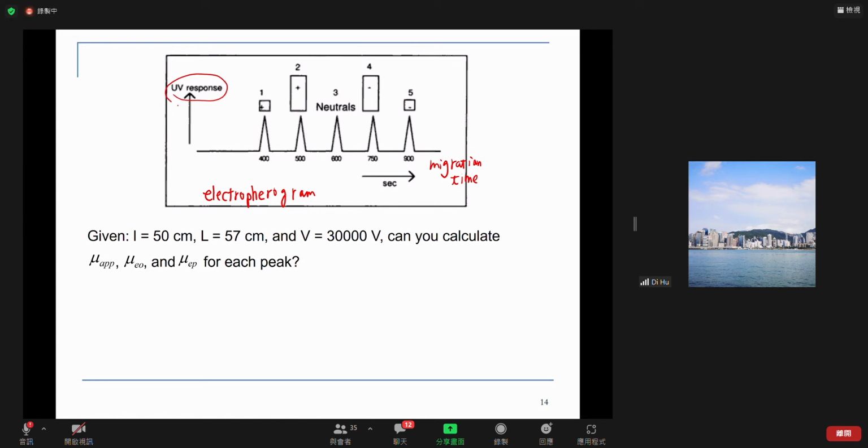But it needs to be something that can have UV absorbance. It can be fluorescence as well. It can be conductivity as well if you're using ions. And it can also be a mass spectrometer.